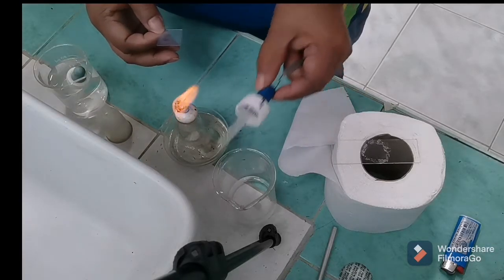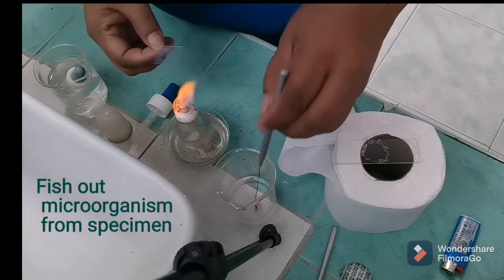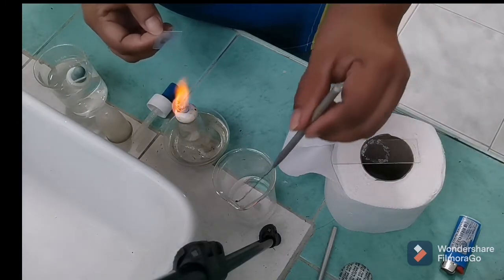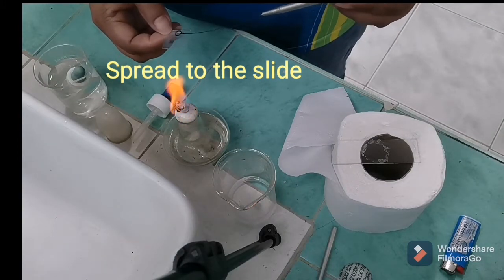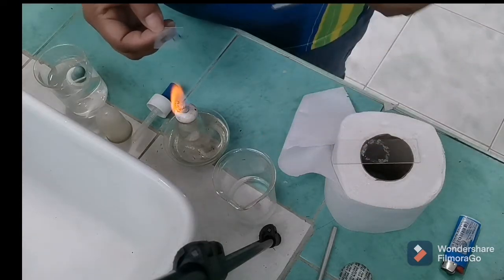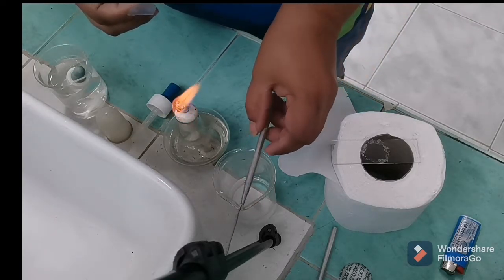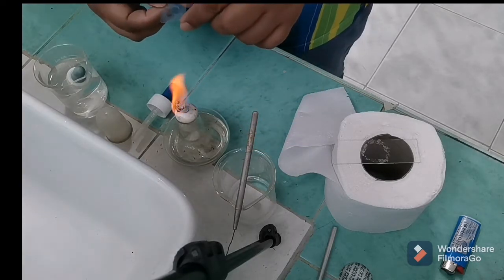After that, I will fish out some of the sample. I could place it simply at the center, or I could spread it all throughout the cover slip. What is important is that I have a moving liquid so that I could see the moving microorganism later on in the microscope. So it is a hanging drop method.